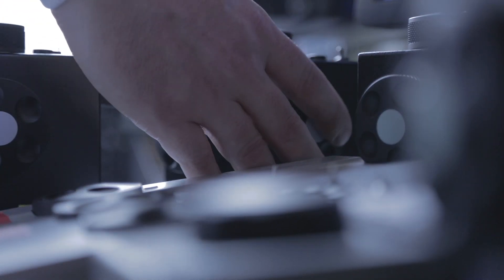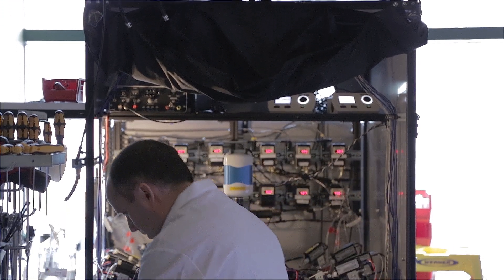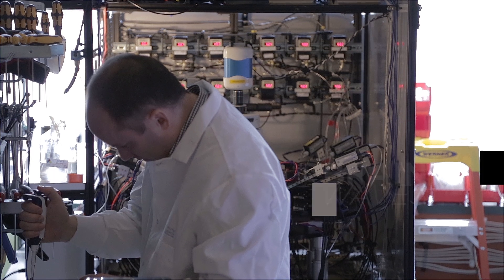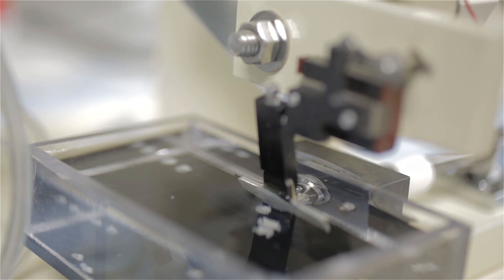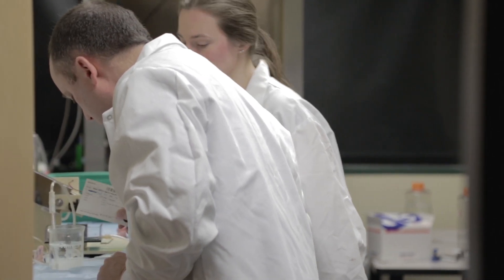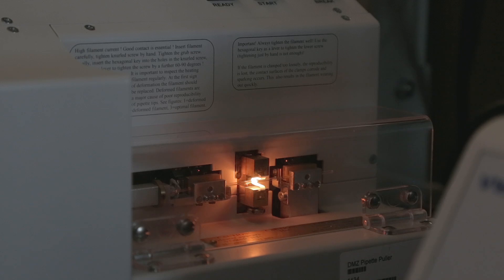Getting good at these experiments is, in many ways, like getting good at a sport — you don't think about what you need to do, you just know what you need to do. The goal of trying to record from 12 neurons at a time is a very ambitious goal, but what we're trying to do along the way is figure out what is reasonable and how many is reasonable.